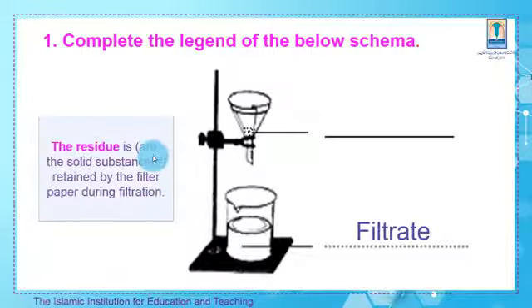Also remember, the residue is the solid substance retained by the filter paper during filtration. And here, which one is the solid substance retained by the filter paper? It's the sand retained by the filter paper placed on the funnel.